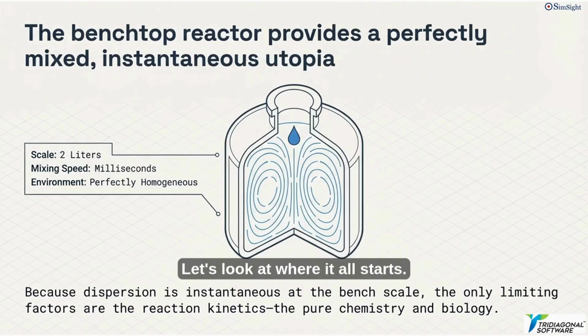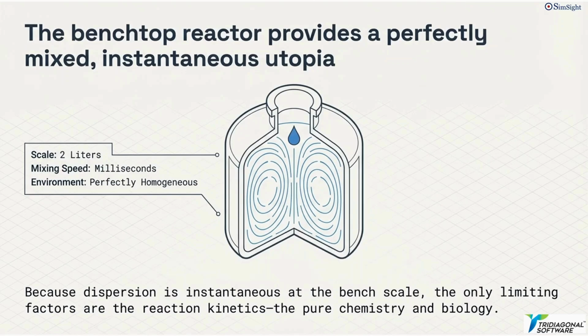Let's look at where it all starts. The benchtop reactor. This little 2-liter tank is a perfectly mixed, instantaneous utopia. Now, when you add a drop of feed, it mixes literally in milliseconds. The whole environment is totally homogeneous.